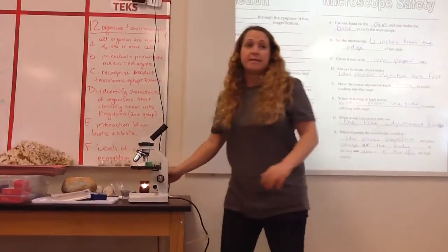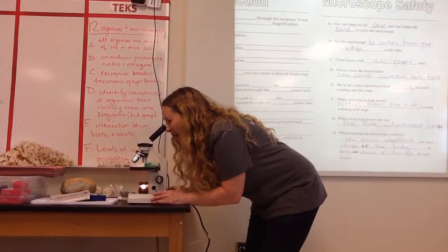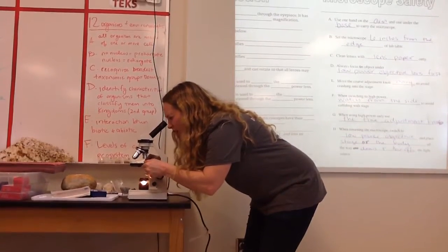I'm all the way raised. Now I'm pretty ready to get it to work. Okay, so I put my eye on. Now I can see a little blue object. It's not right in the middle, so I'm going to move the slide a little bit till it gets right in the middle. It's really weird on the microscope.